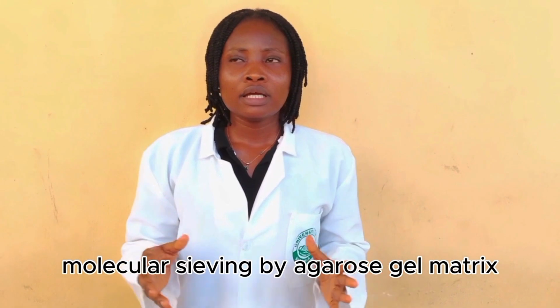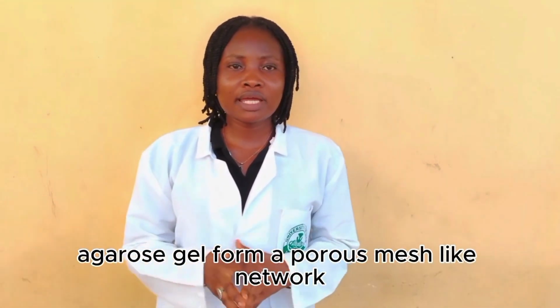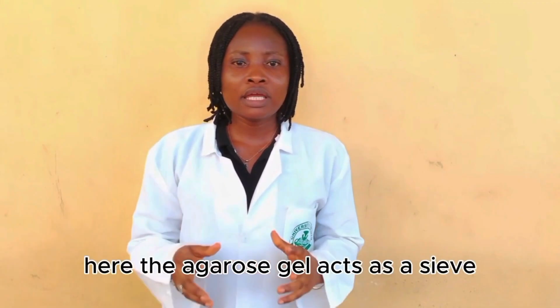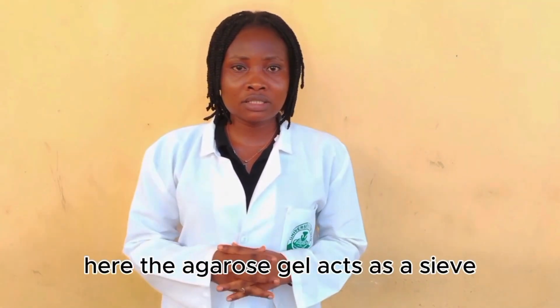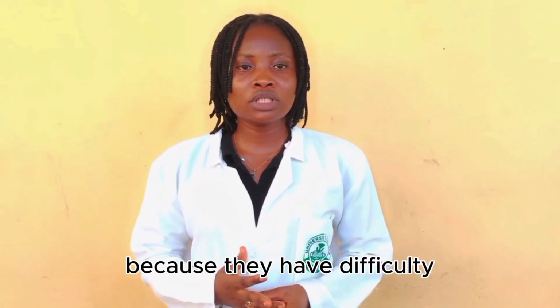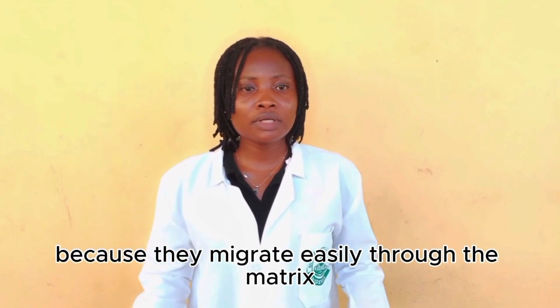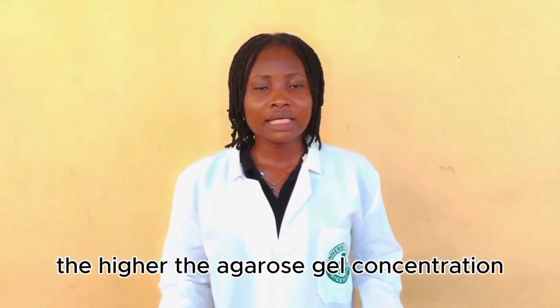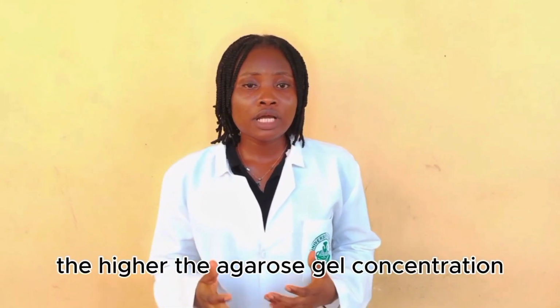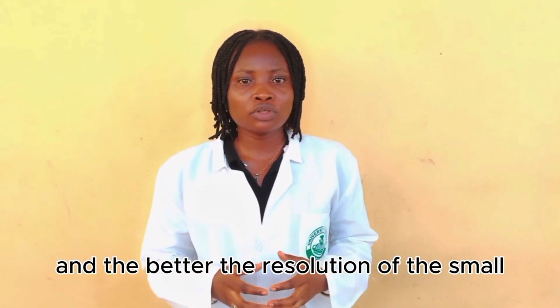Principle number 2, molecular sieving by agarose gel matrix. Agarose gel forms a porous mesh-like network when it solidifies. Here, the agarose gel acts as a sieve. Large DNA fragments move slowly because they have difficulty passing through the small pores. Small DNA fragments move faster because they migrate easily through the matrix. That is, the higher the agarose gel concentration, the smaller the pores, and the better the resolution of the small DNA fragments.